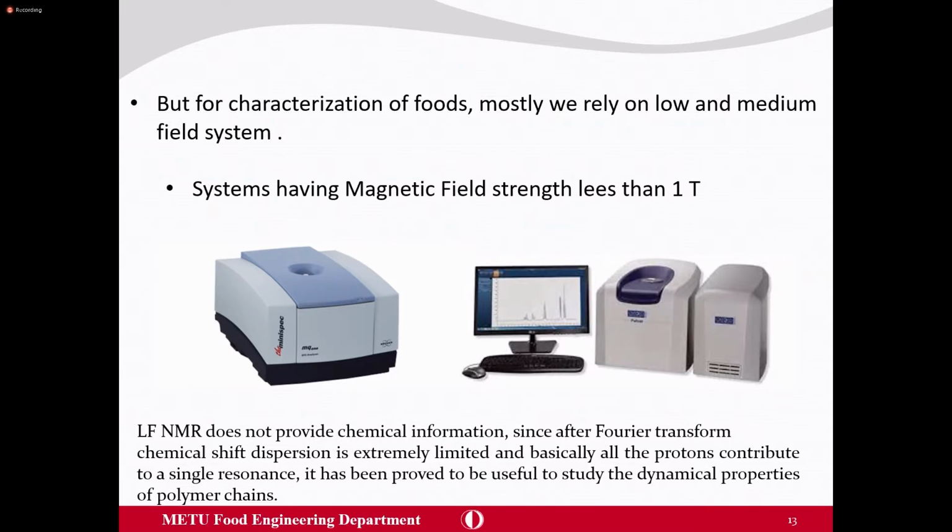The ones that I showed you were working at 300, 400, 600 megahertz, and now there are even lower field systems which are also capable of doing spectroscopy.